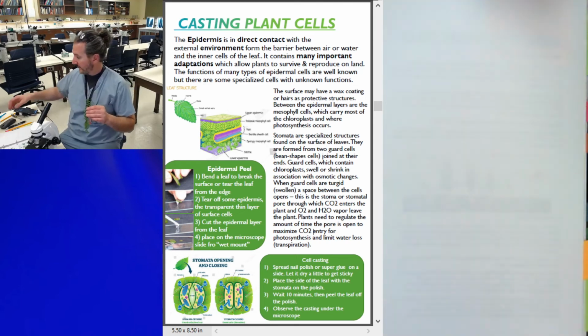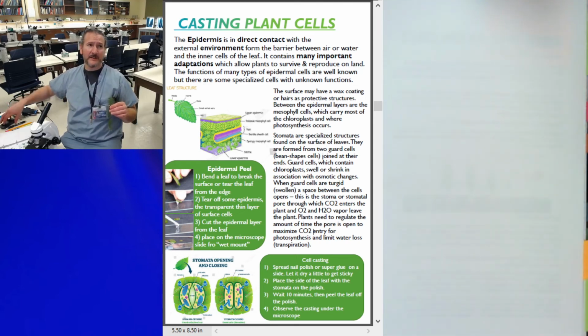And then I'm going to let it dry for about 10 minutes. I want to make sure that it's completely dry, because if I don't, it won't work at all. So you can get up, use the restroom, get something to drink, and I'll see you in just a few minutes.